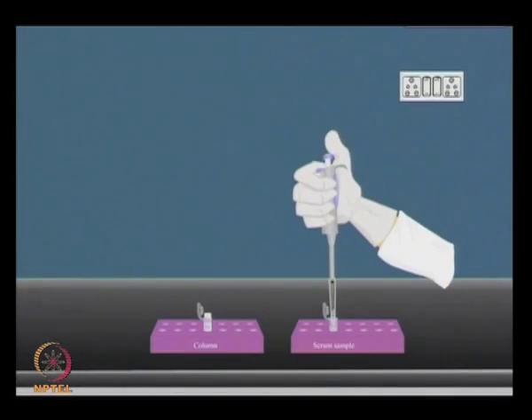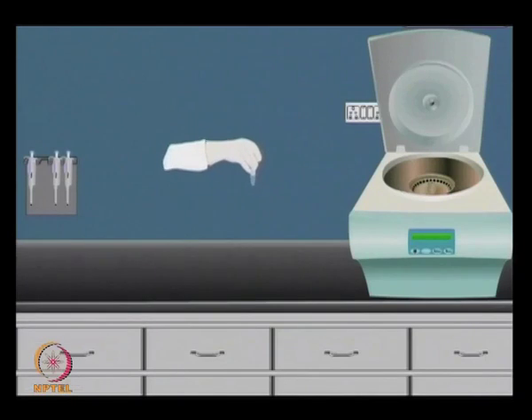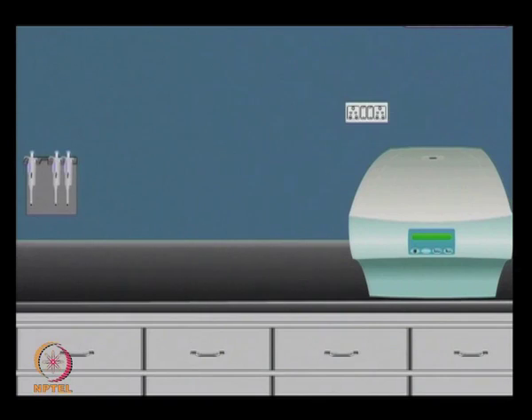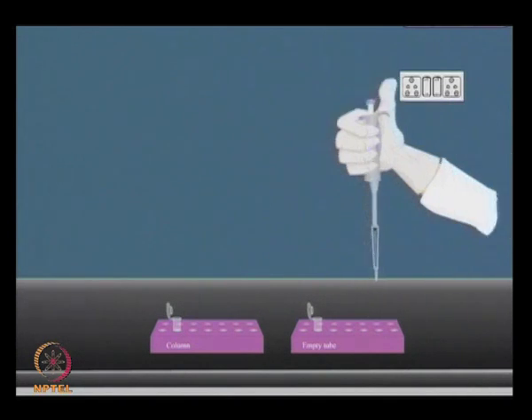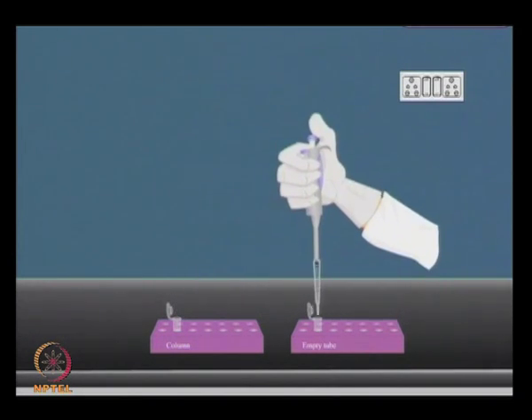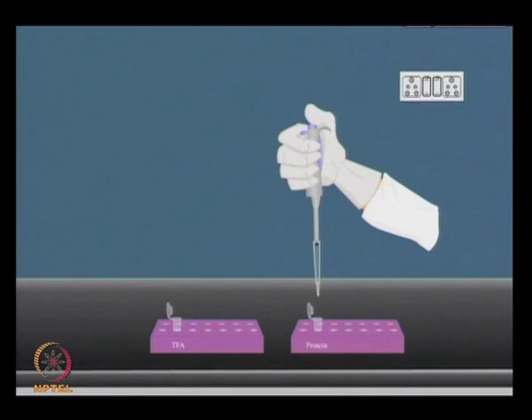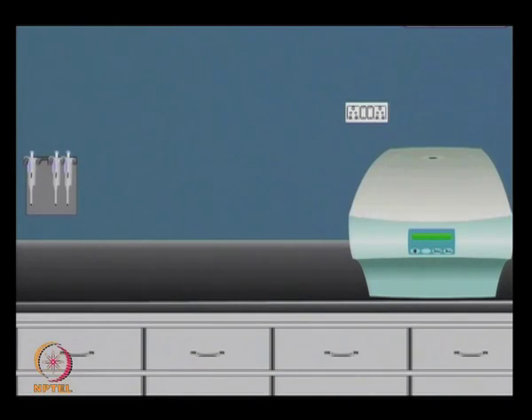After sonication is done, then we can add the serum sample on the columns. Usually these are commercially available, which can deplete various high abundant proteins. Now, these depletion columns bind only the high abundance proteins onto their matrix through the affinity interactions. Once the serum has been processed using a depletion column, precipitate out the remaining proteins by using trichloroacetic acid and acetone.